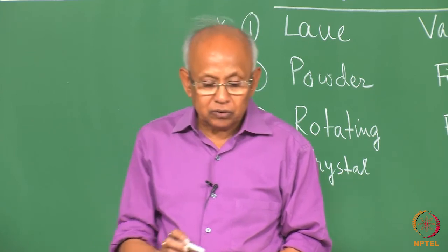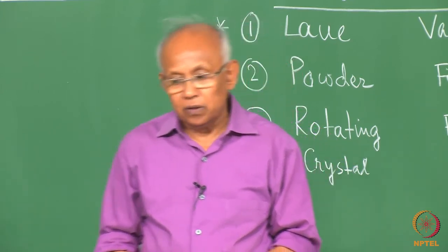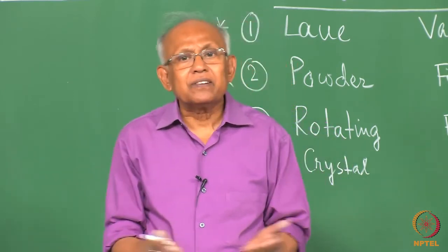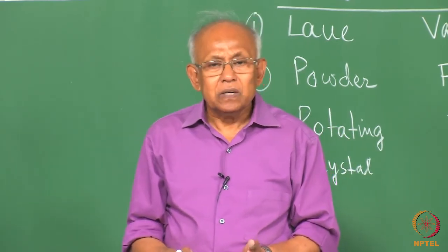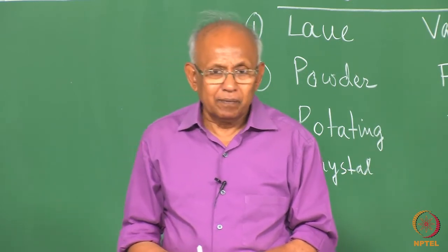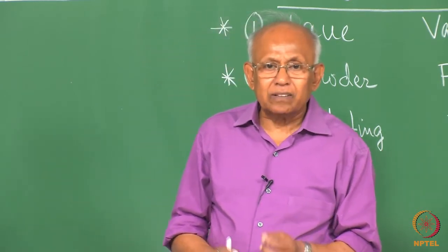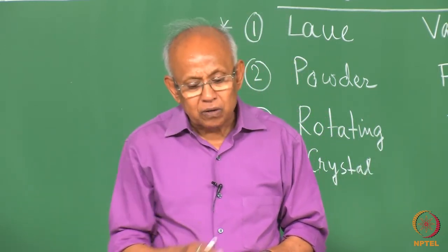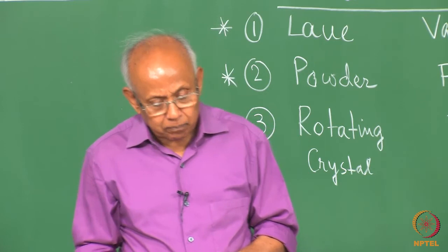That can be used as the sample. Or if you have a very thin polycrystalline sheet of a material, with a pair of scissors you can cut out a thin, small length, and that can be used as the sample.